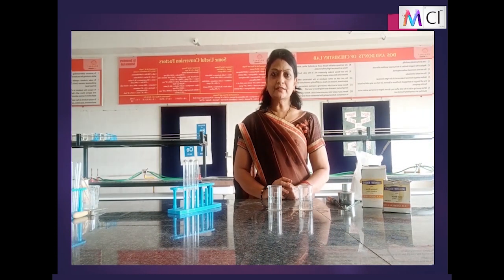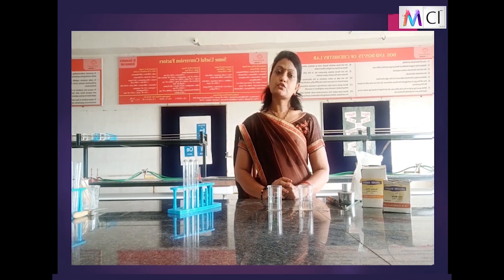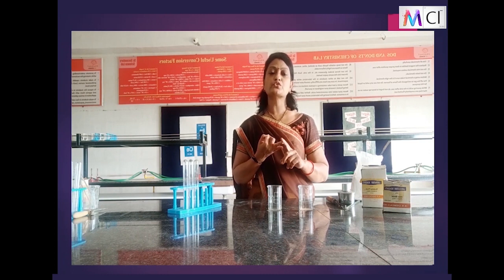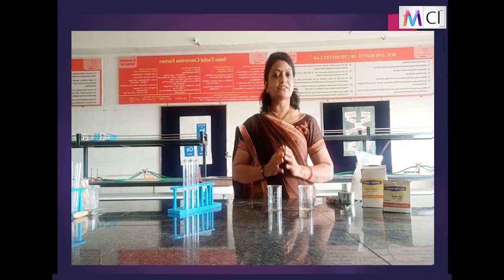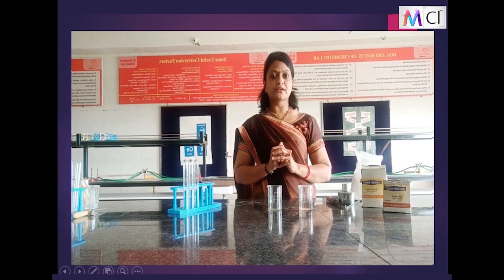Good morning children. In today's practicals, we are going to see the types of reactions, standard 10. In Chapter 1, we have already studied the theory, that is the different types of reactions: combination, decomposition, displacement and double displacement reactions. Let us see all these reactions one by one. First, we will start with the combination reaction.